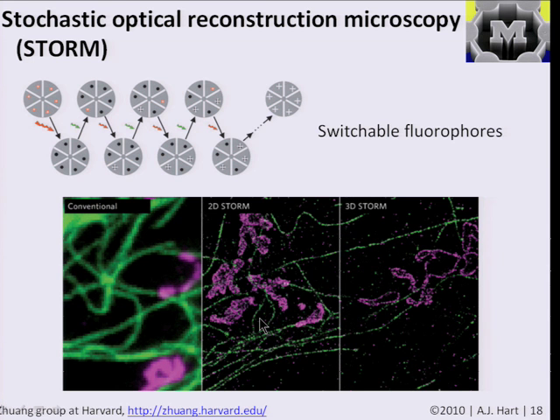So one of the goals here is to be able to get three-dimensional optical images of things like cells and tissue, and this is something that would be very difficult or impossible to do in electron microscopy, because we'll see that for electron microscopy you need a sample that's electrically conductive, and tissue isn't electrically conductive, which means that you'll burn it, you'll dry it out in the vacuum environment, or you'll have to coat it, for example, with metal if you wanted to image the surface, and that can clearly destroy the types of information that you might want to see.